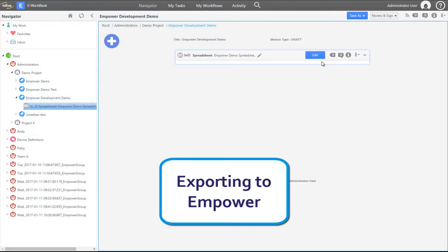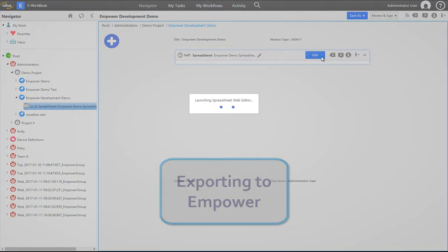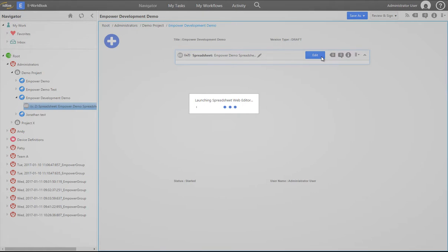Sample data can be exported from eWorkbook spreadsheets to Empower to create sample set methods that can be used for data acquisition.